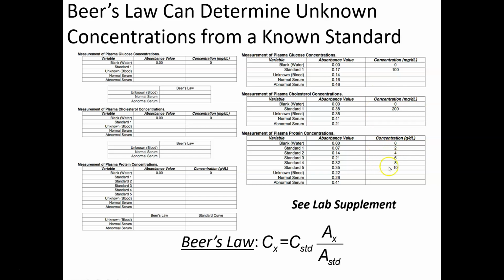Well, when we come down here, you say, okay, I'm going to do plasma. I could theoretically use any one of these standards, but we want to use something that's close to physiological values. So when I look, I go, okay, well, the norm for protein is 6 to 8 grams per deciliter, actually 6 to 8.4, I think the current Fox book says now. And so you'd think, okay, I want to use 6 to 8.